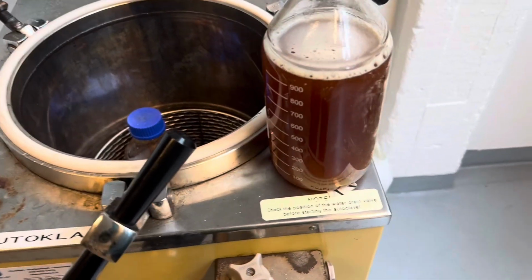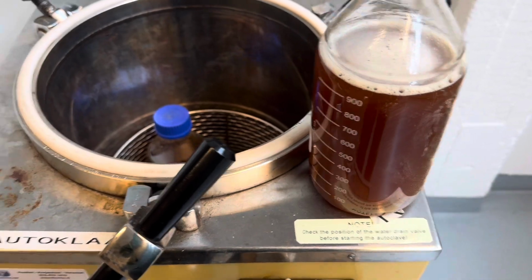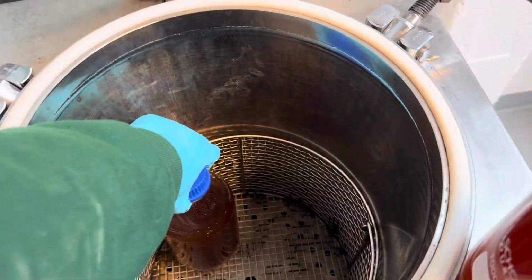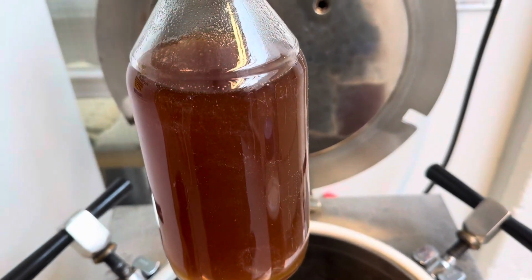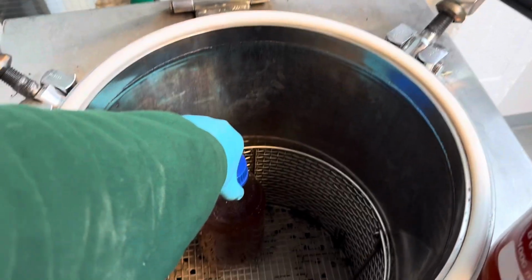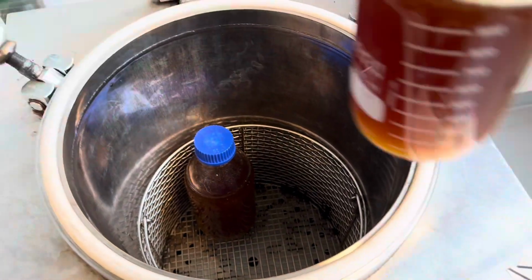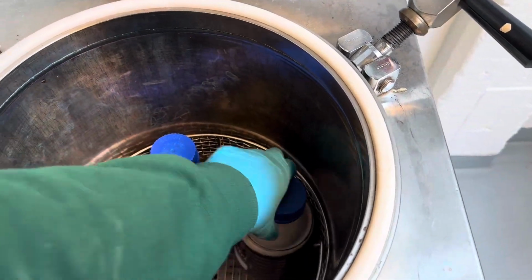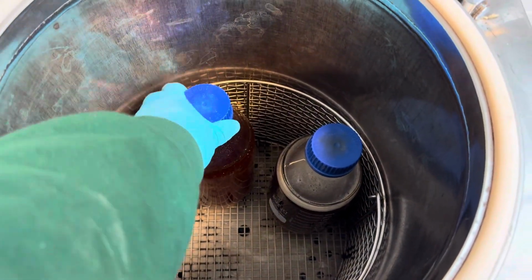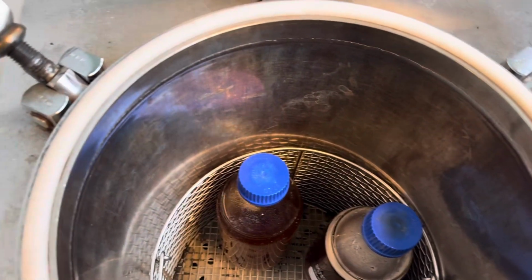Alright, so now after dissolving the water with the agar and malt extract, you can see on that machine that I showed you in the earlier step, now I'm going to place them inside the autoclave. And remember that when you place these bottles, you need to make sure that the lids are a little bit loosened up.